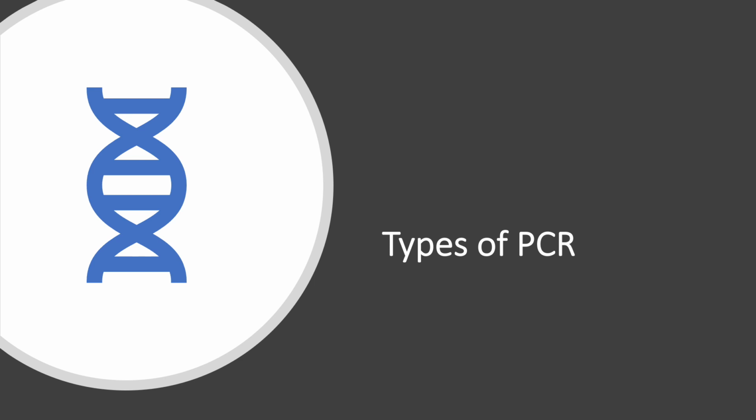Now, let me give you the different types of PCR. So these are the most commonly used PCR formats used in most molecular biology laboratories. Please take note of the significant features of each type.